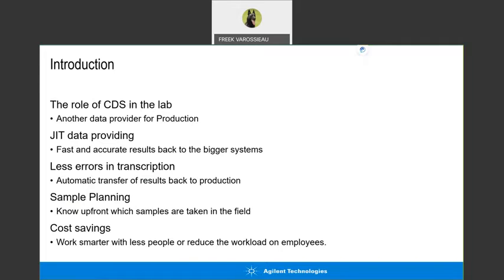So in the bigger picture, from an IT perspective and from your operation perspective, the chromatography data handling system, your CDS, is just another granule in a large heap of sand. It is an important granule though, because we're providing a lot of information, and based on that information, production will be altered, will be steered, and also particular results and batches and products will be released based on the results we provide.